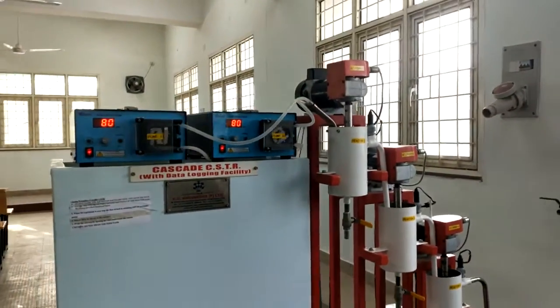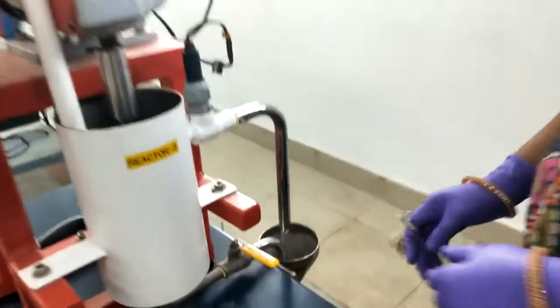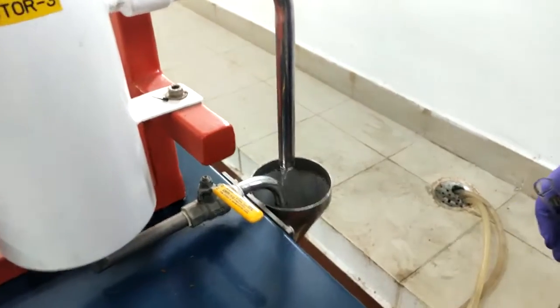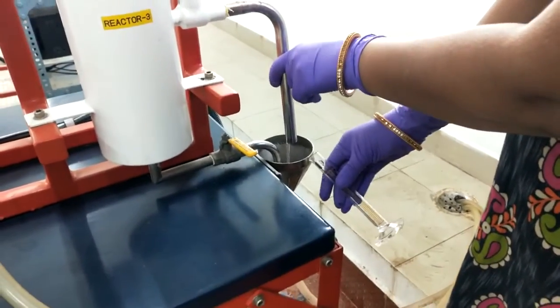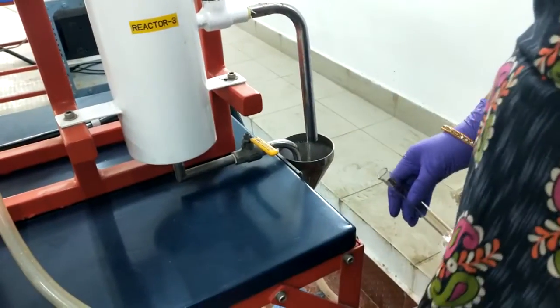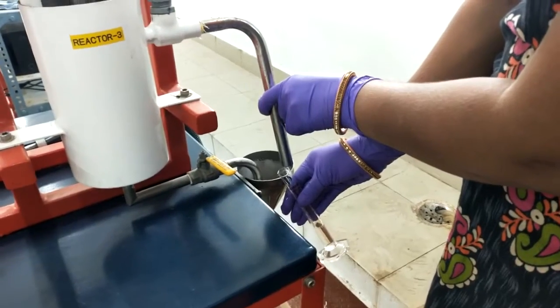Okay, so the flow of fluid from the third reactor started coming out. We waited for 5 minutes. Okay, so after waiting for 5 minutes, we collect the sample of 10 ml.